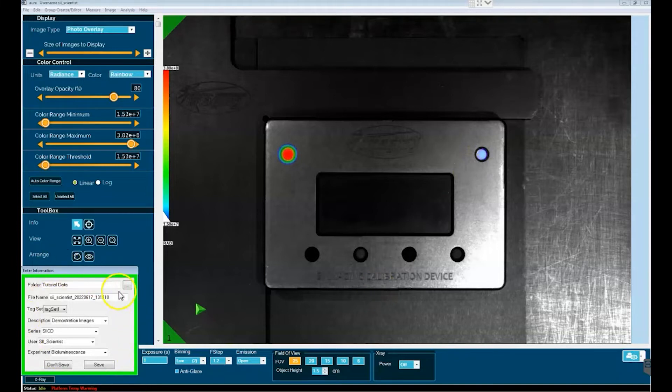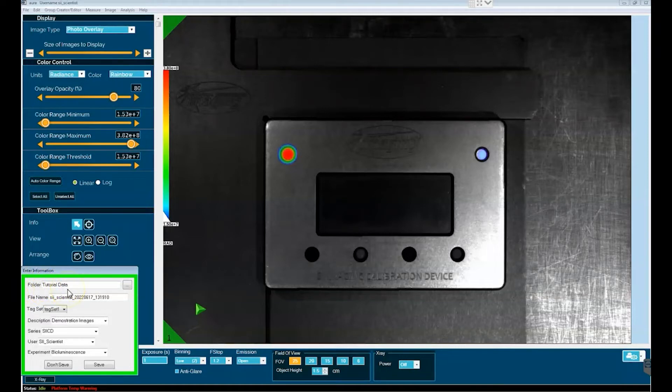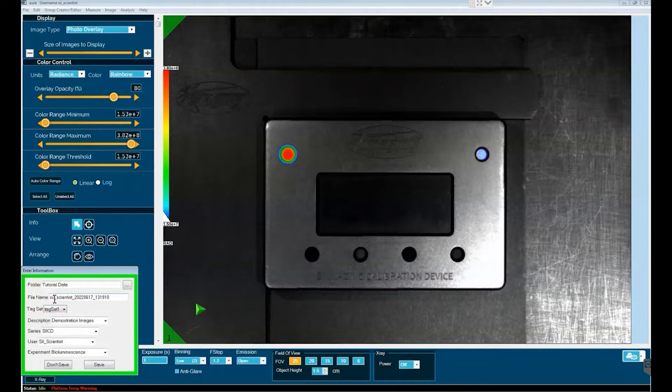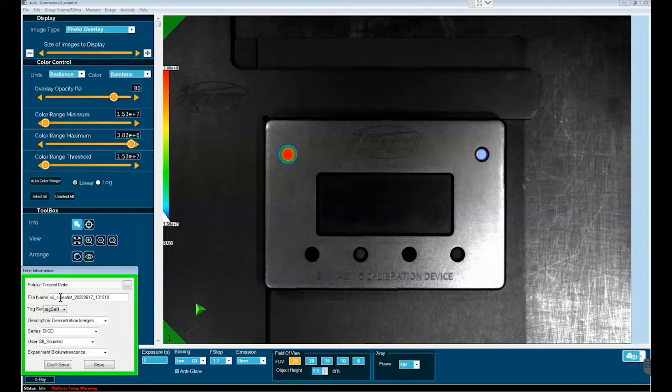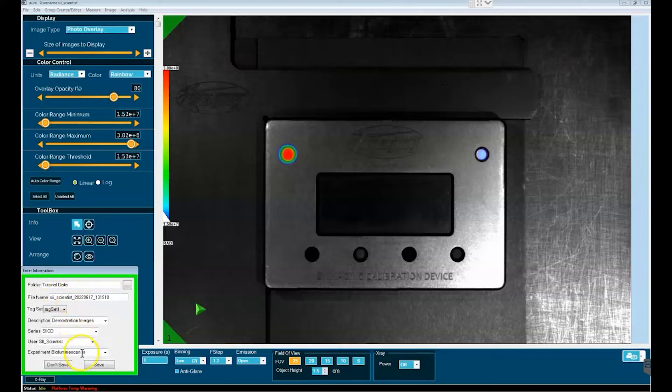This green rimmed window is basically a summation of the metadata associated with the image that we've just taken. At the top you have the folder window which is going to give you the opportunity to save the image in a particular location, and I've already designated this. Below that you have the file name of the image, and this is something you definitely do not want to change because it will be used by the image manager system of Aura to organize the files.